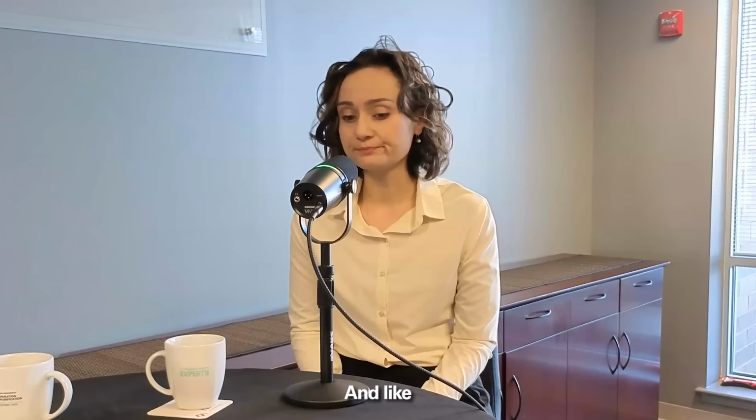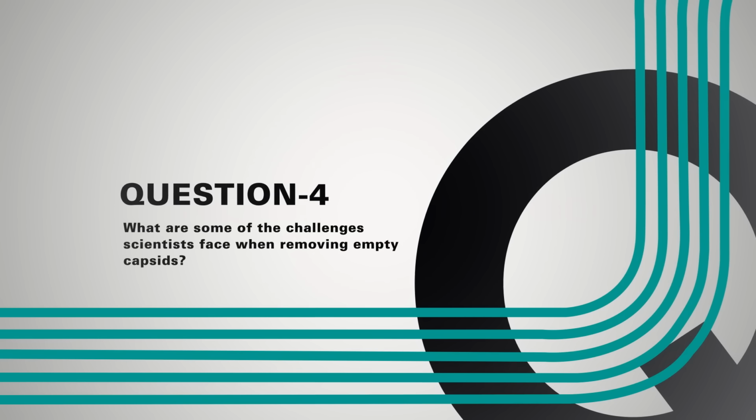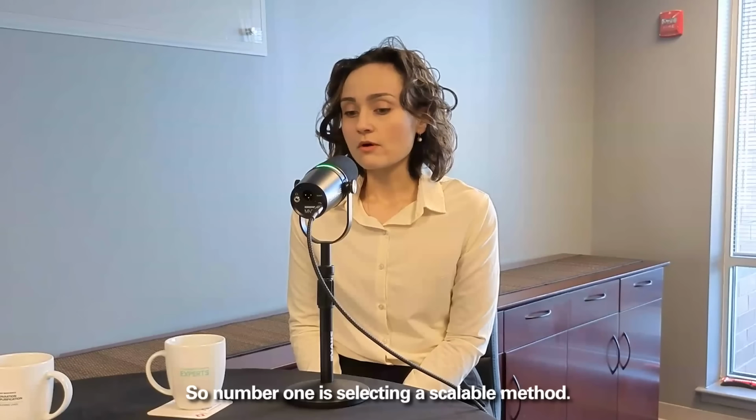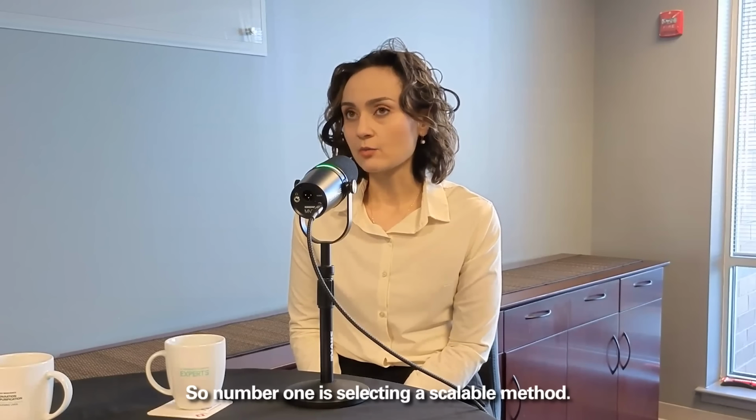Okay. And so what are some of the challenges that scientists face when you go to purify that, removing those empty capsids? I imagine there are quite a few challenges there. Sure. So, number one is selecting a scalable method.